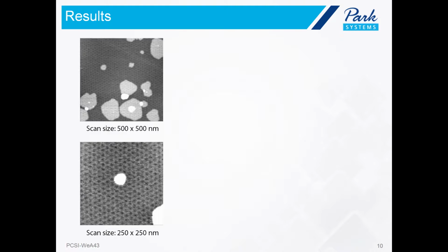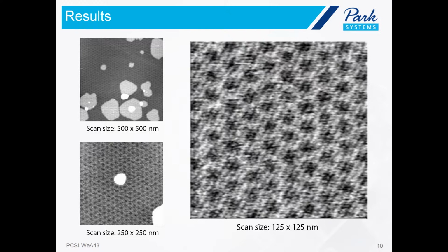But as we can see here, that overlay that's occurring over the entire scan, it's not noise. There is definitely a set pattern occurring with a uniform regularity all across the surface of the sample in a series of areas of darker contrast that look like holes.